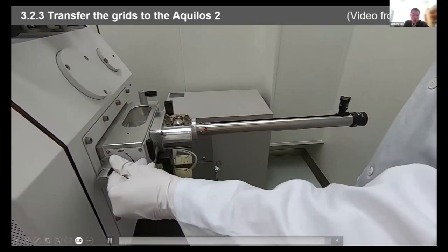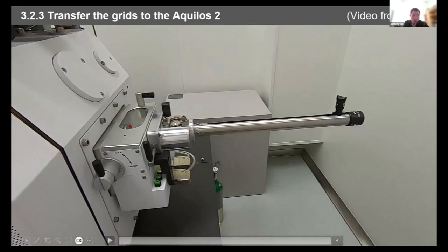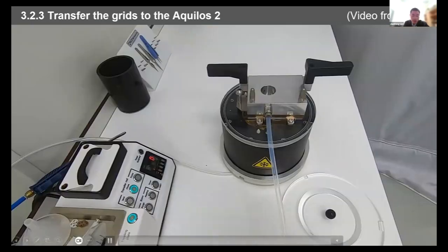You can keep the transfer rod here because if the sample is not good, you can immediately pick up the sample and try to change another batch of samples. But if it's good, you can still keep the transfer rod here to keep it in vacuum conditions. When the lamella is finished, you can still pick up the sample and go back.